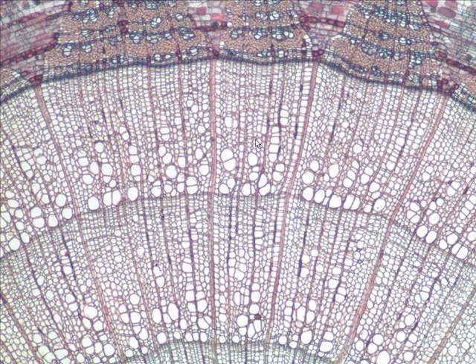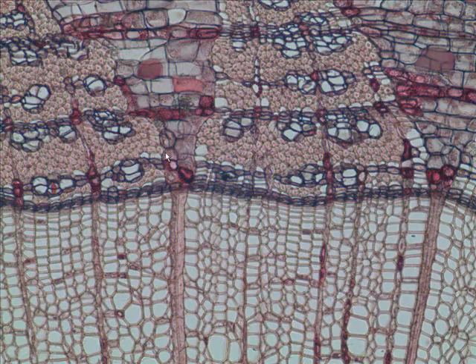And so, what are these larger cells called? This area where there are larger cells toward the inside of a ring, it's called what? Springwood, as opposed to this, the cells more toward the outside of the stem, that's called what? Summerwood. Springwood to the inside, summerwood to the outside. Each ring has springwood to the inside, summerwood to the outside. All right, let's keep moving a little farther.